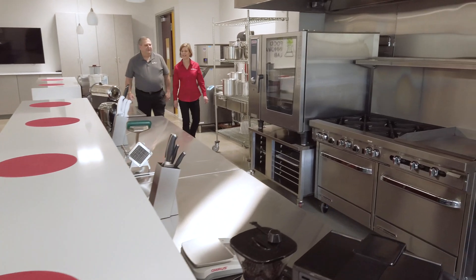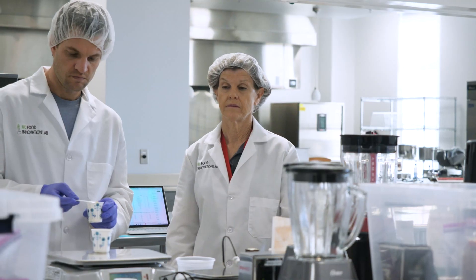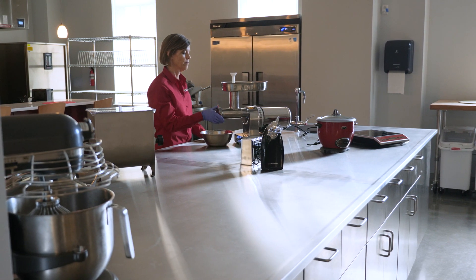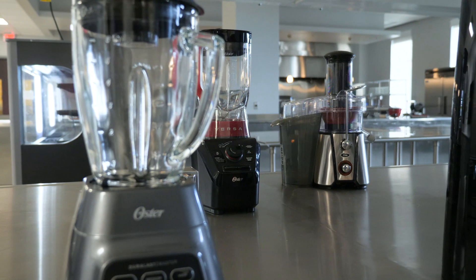Our product development lab was designed with two things in mind: actual new product development and plant-based foods, and the need to cook these products — so we built a commercial kitchen, not a residential one. We set this lab up as a test kitchen, more like a restaurant environment with a range and griddle, alongside a product development lab with a confection station, a meat analog station, a plant-based entrees area, a bakery section, a beverage section, and a QA/QC quality control area where we do product testing such as water activity, moisture analysis, and color analysis.